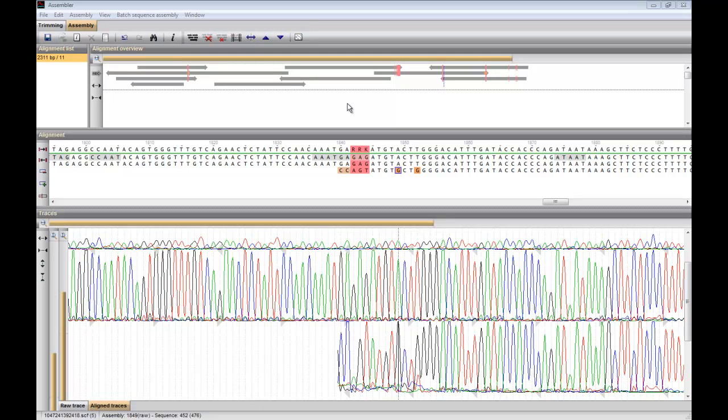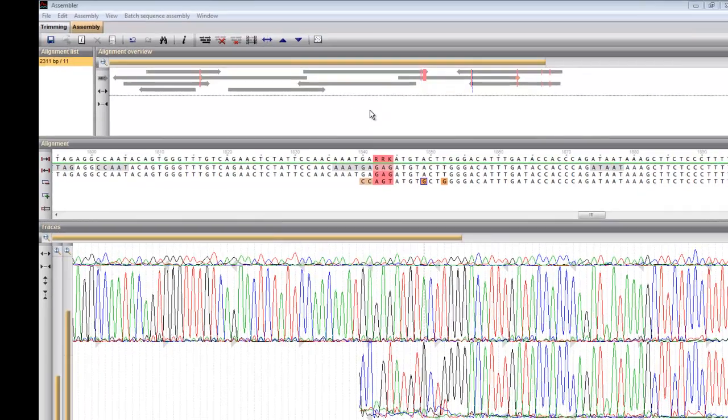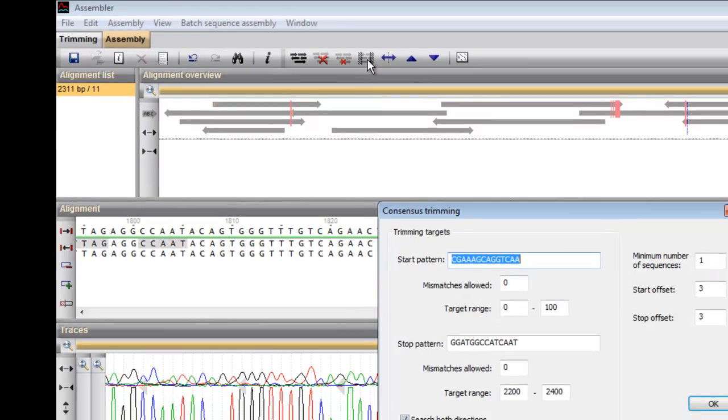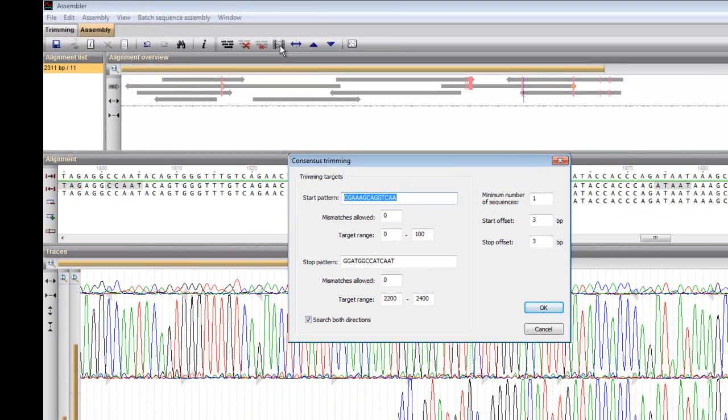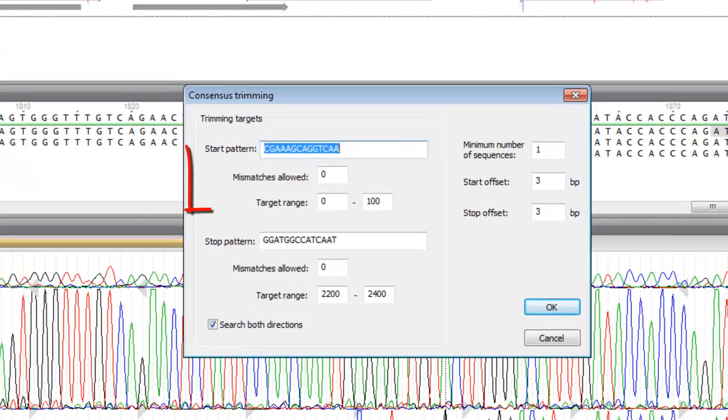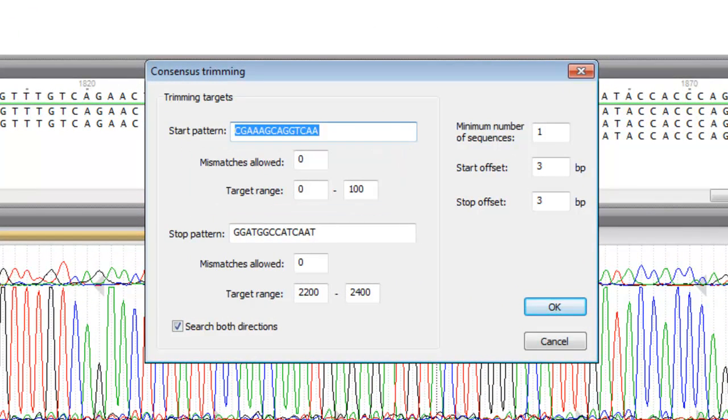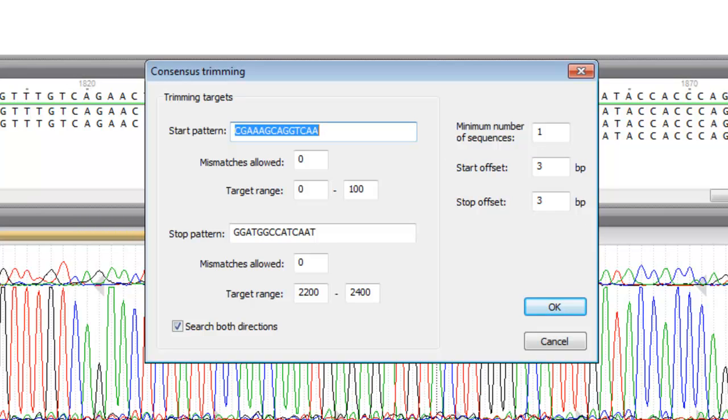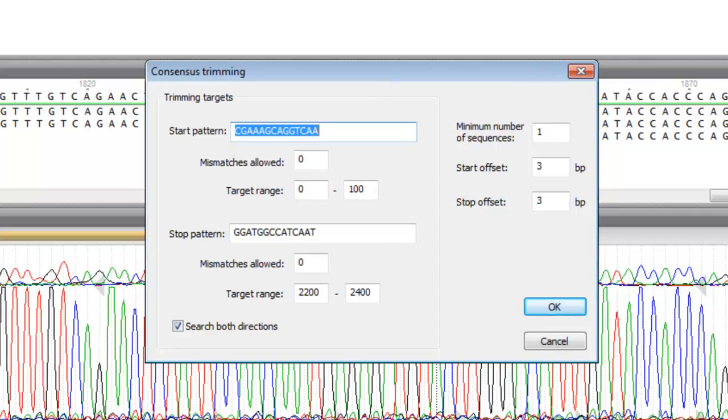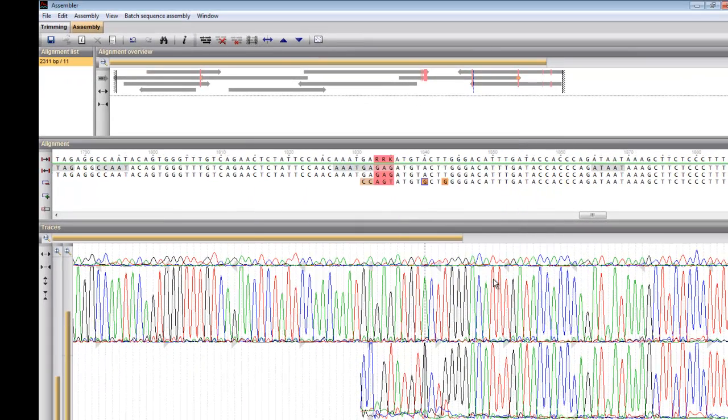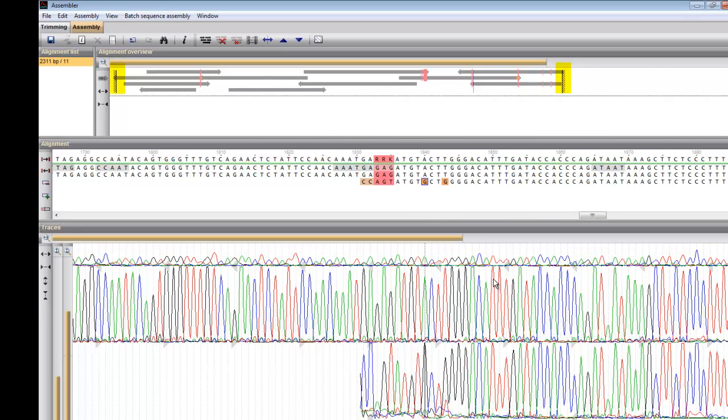Possible primer ends can be trimmed off the consensus sequence. Press the consensus trimming button to enter the target patterns to look for. You have a choice to allow mismatches and specify a target range in which the trimming site should be found. The number stated in the offset boxes indicates the amount of base pairs to be trimmed off the target and thus to be left out of the consensus sequence. I click OK and the trimming ends are indicated on the graphical overview.